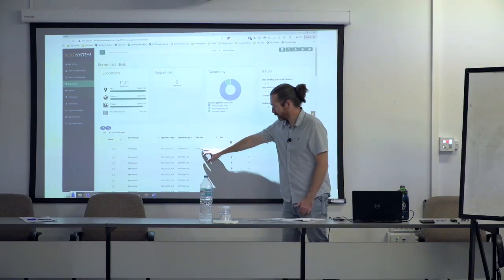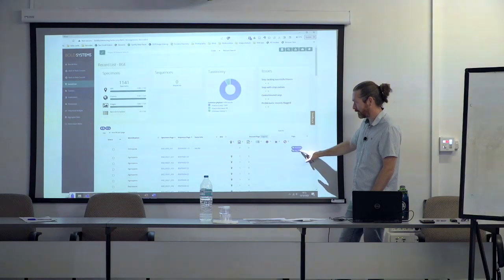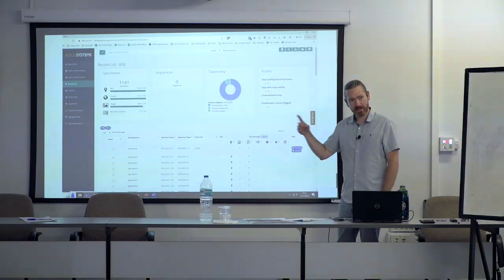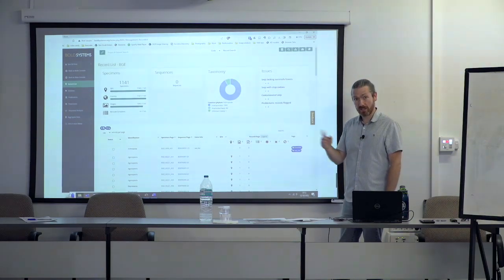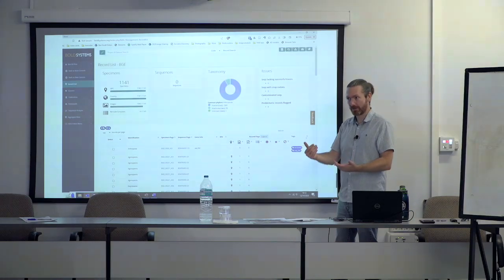Ignore sequence fail and these tags that I mentioned earlier. So I added these tags here because I was doing some playing to see what was available via the API and via the public records so that I could bug Sujeevan to make changes so that we could use it to track samples.